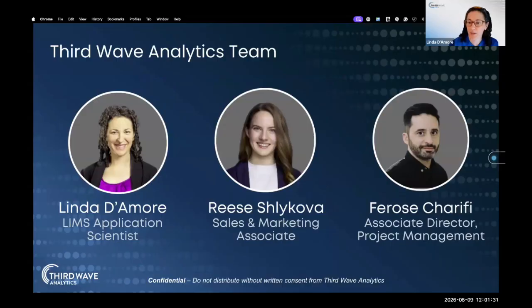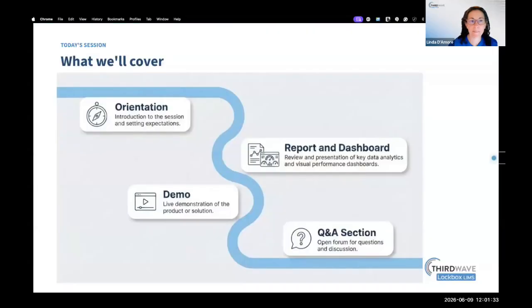And today we are going to deliver a webinar that is going to cover reports and dashboards. We're going to cover the basics. I'm going to go through what the benefits are, why you should use them, and where you can find them in Lockbox. And Riz is going to give you a demo, just introducing a little bit of the basics of creating a report and a dashboard.